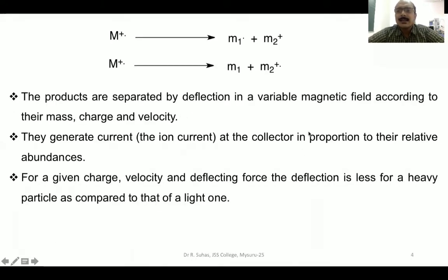As I said, the energy possessed by the electrons is very, very high. So the molecular ion undergoes further fragmentation to form what are known as daughter ions, also called fragment ions. M plus radical is called the molecular ion or parent ion. The small m's are called fragment ions or daughter ions. A fragment ion can be a radical, a cation, a neutral molecule, or again a radical cation. These different kinds of products are called secondary products, or daughter ions.